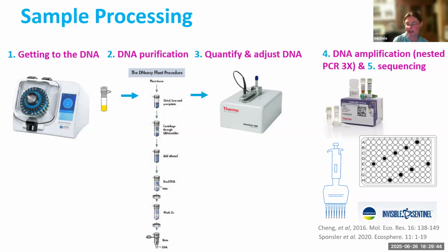So the PCR amplification is photocopying that target piece of DNA that I'm interested in. We have three rounds of PCR that make up our method, and basically they each do a different thing. The first round of photocopying is literally just making more of that target piece of DNA of whatever plants are in there.